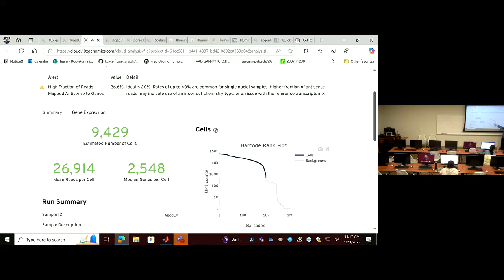And I think by default, Cell Ranger sets the cutoff here, and anything above maybe 500 UMI is considered non-empty. That's okay. You can change the parameter if you know how to adjust that, but normally we just accept this by default. We can do a better job downstream. We will throw away all the cells which do not have enough UMI. I will set a cutoff later in MATLAB.